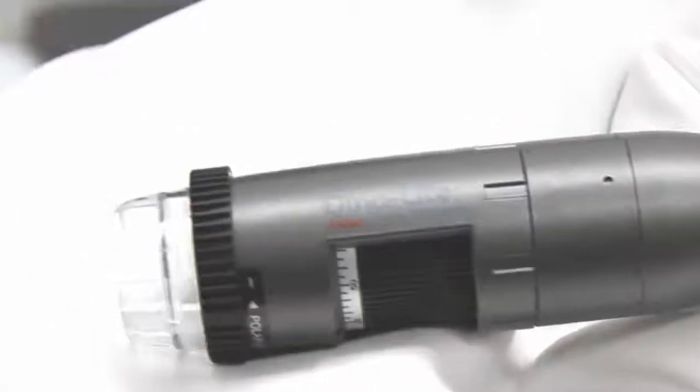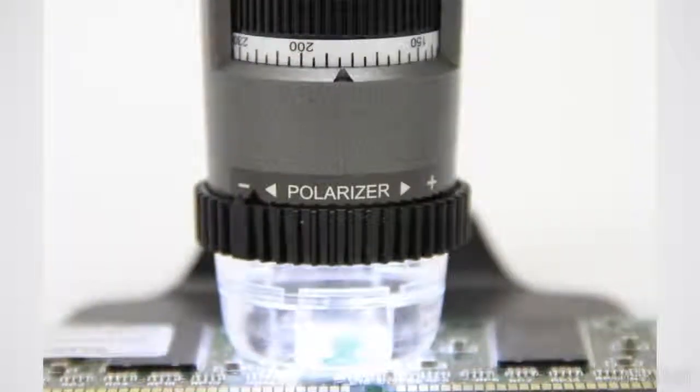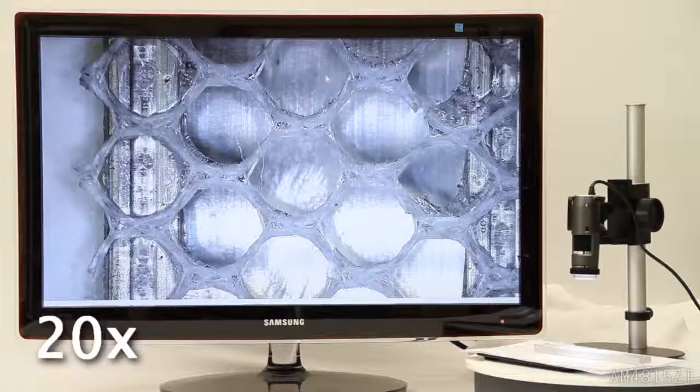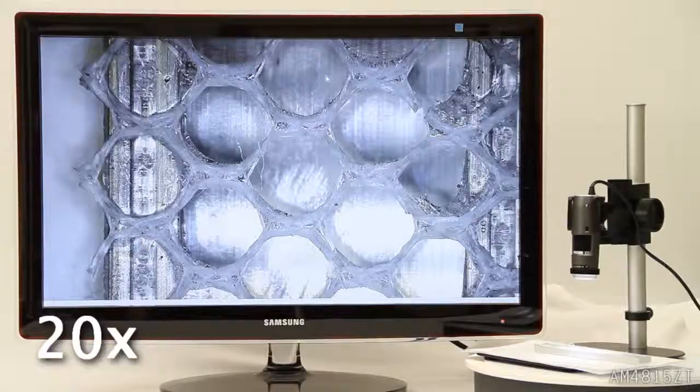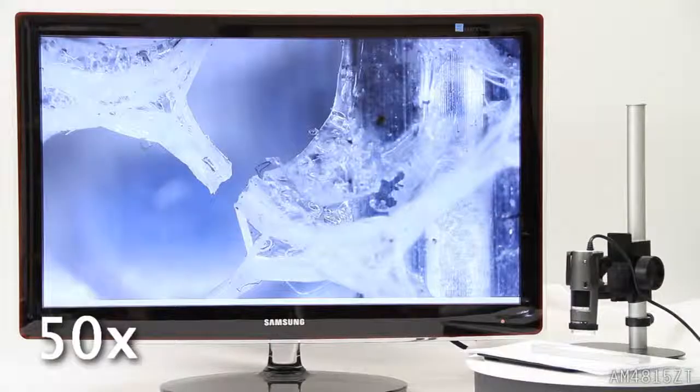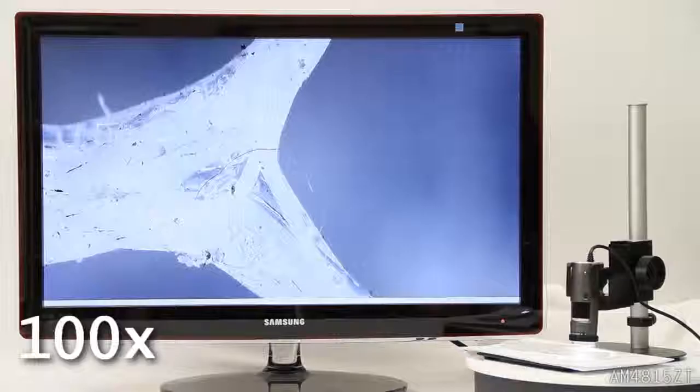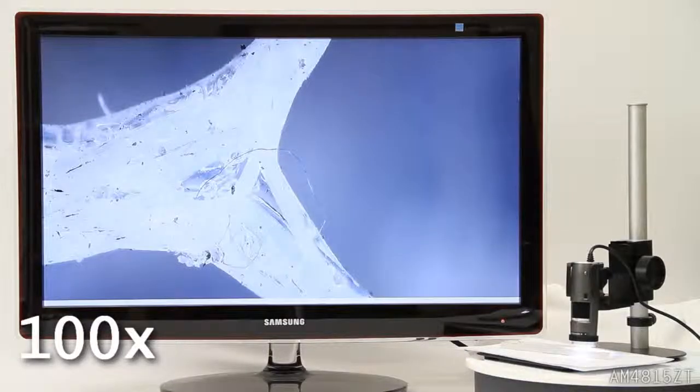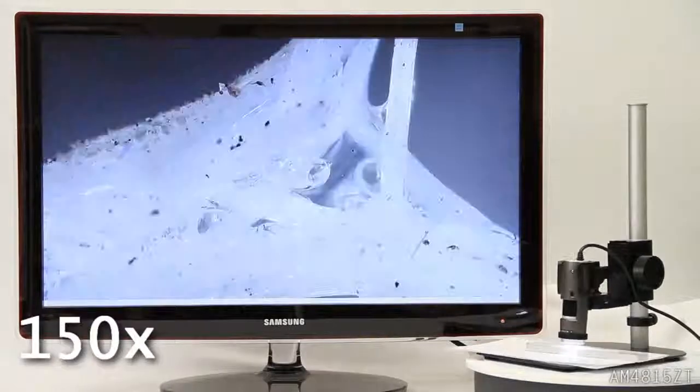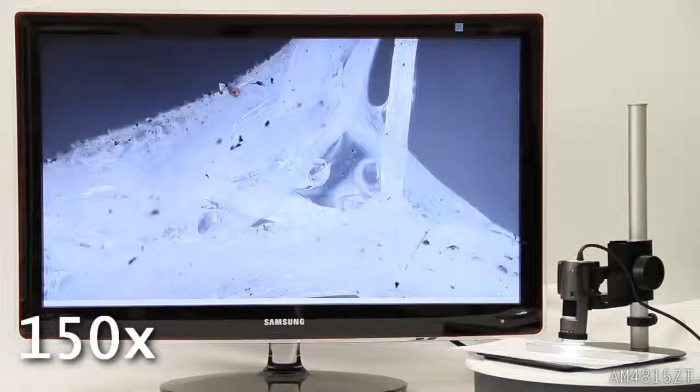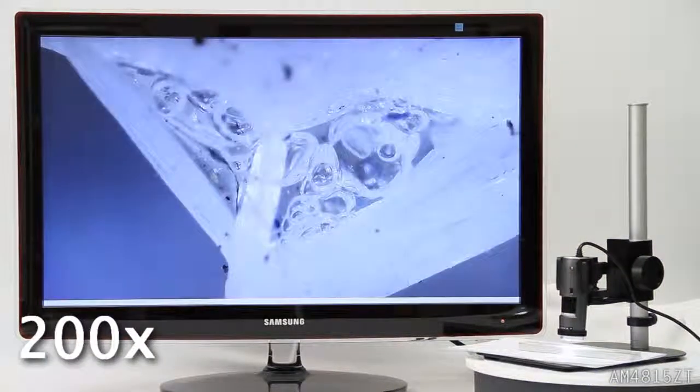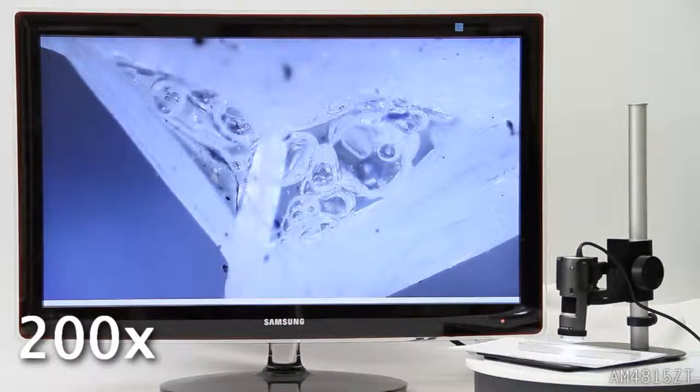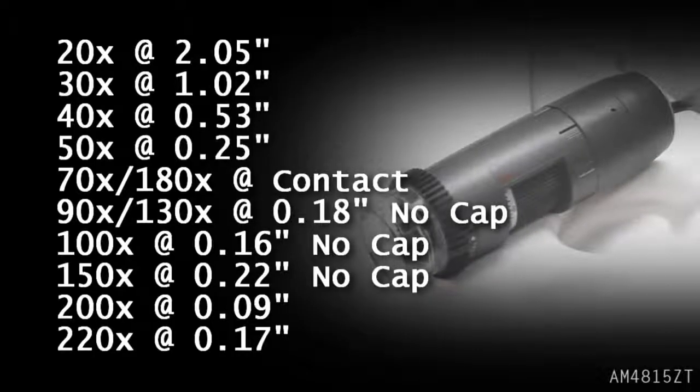Introducing the AM4815ZT Dynolite Edge with Extended Depth of Field and Extended Dynamic Range. This model has all of the features of the AM4115ZT for the highest quality imaging and capturing more details at every level.